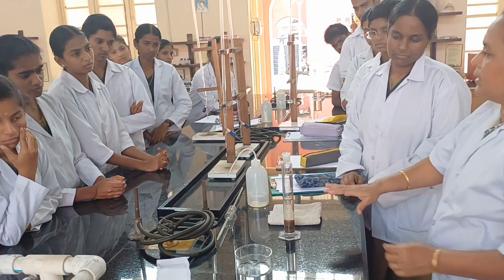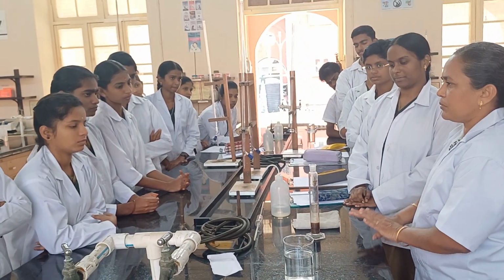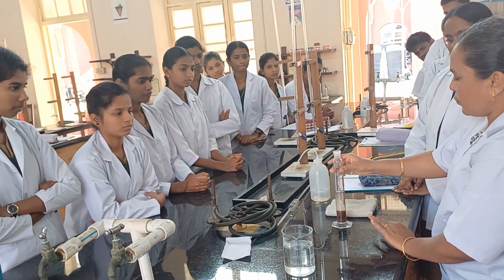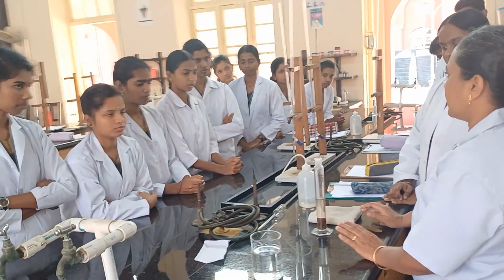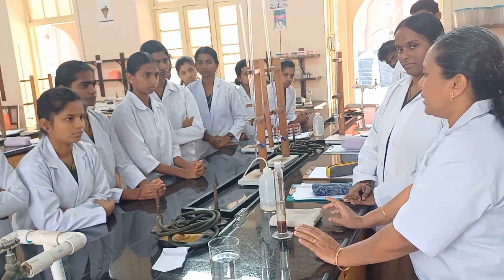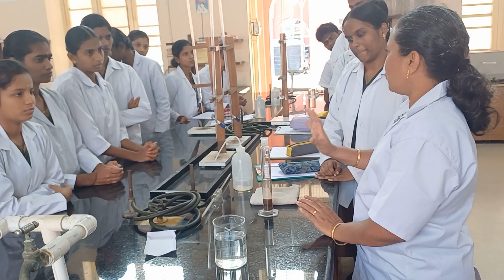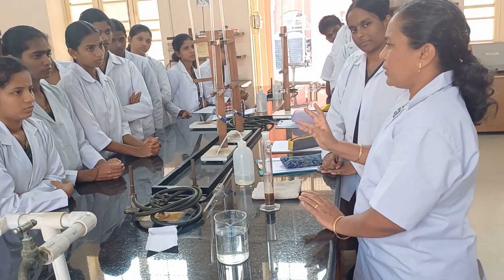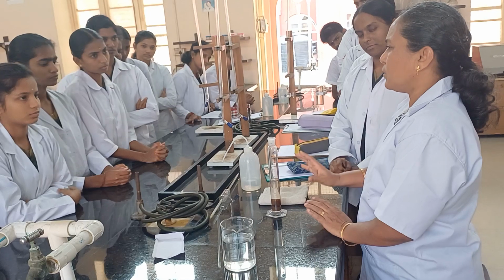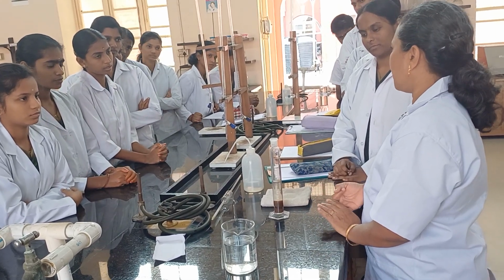The water will enter into the soil and all the pores will be filled with water. After 30 minutes, note down the final volume of the water, which we can denote as V4. So now we have four volumes, V1, V2, V3, V4. Using these values, we can calculate the bulk density, particle density and percent pore space.